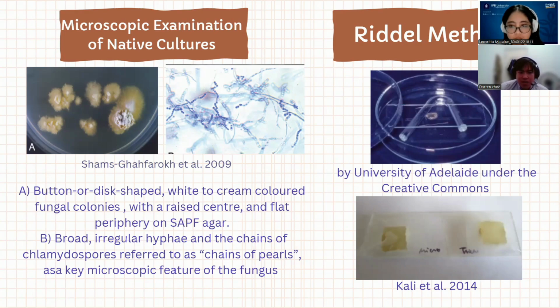And for the Riddell method, this is just an example. There are many methods to do it. Some use a U-shaped glass rod, like the top picture, and some use just a block of agar with the microscope slide placed on top of it.